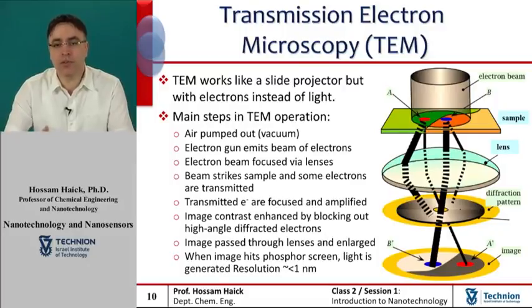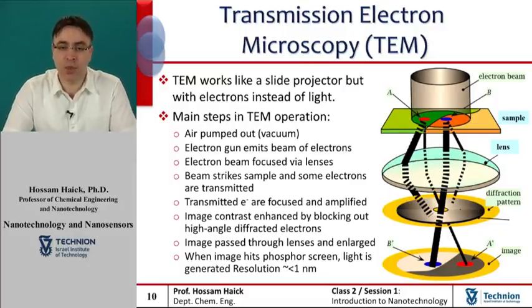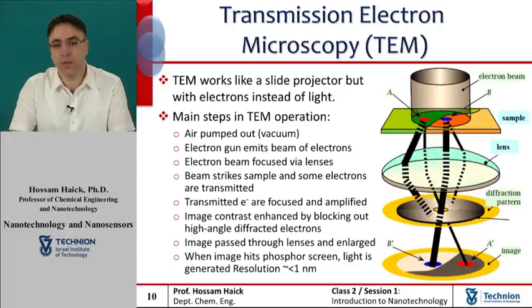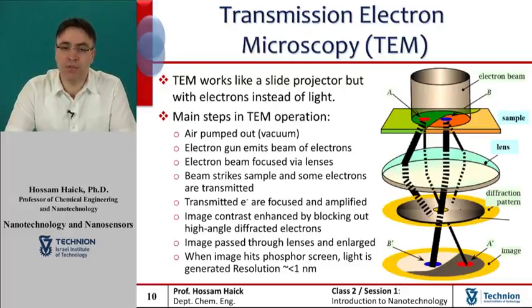The ability to determine the positions of the atoms within materials has made the HRTEM an important tool for nanotechnology research and development.